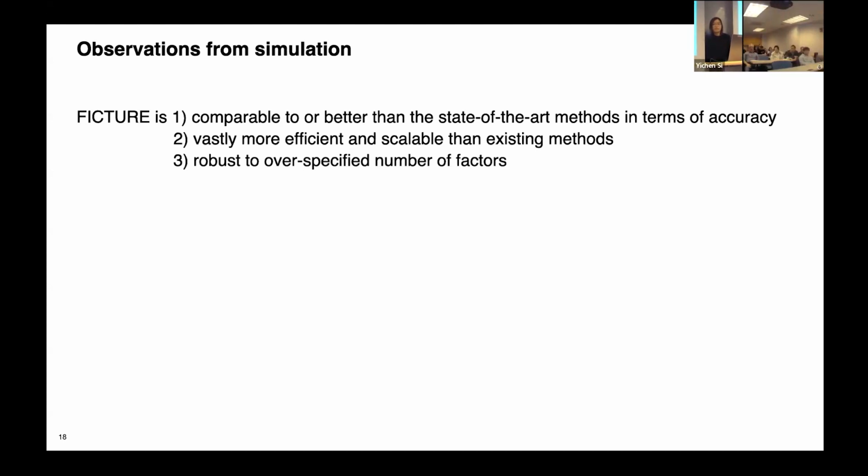It would seem that FICTURE would be more appropriately used as a prior for the segmentation, rather than the other way around. That's what we are currently thinking about. That's right. So I guess if you have nuclear information and cell boundary markers, you can use that as a prior for FICTURE as well. But yeah, thank you.